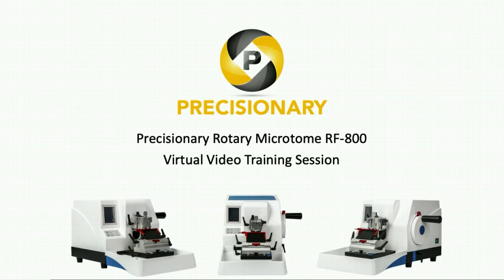Virtual video training session for the Precisionary Rotary Microtome RF-800. This model is a semi-automated microtome for cutting tissue slices for histopathology. Our microtome can make sections from paraffin wax embedded samples. I'm excited to show you today how to unpack your new microtome, how to set it up, and how to begin making tissue slices for your experiments.